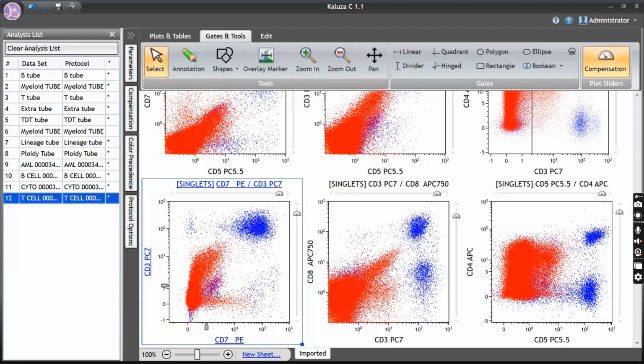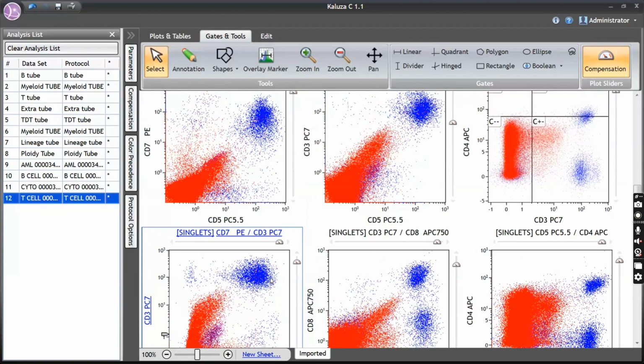Just to share an experience, we had 2-3 cases with aberrant CD5, but not CD4. Haven't seen CD4. Aberrant CD5, I agree, I have seen. That is possible, B-ALL with aberrant CD5. I have seen papers published on aberrant T cell markers in B-ALL. CD4 is something which is weird. And in a case showing myeloid markers, when CD4 is present, it's itching whether I am missing a monocytic component here.